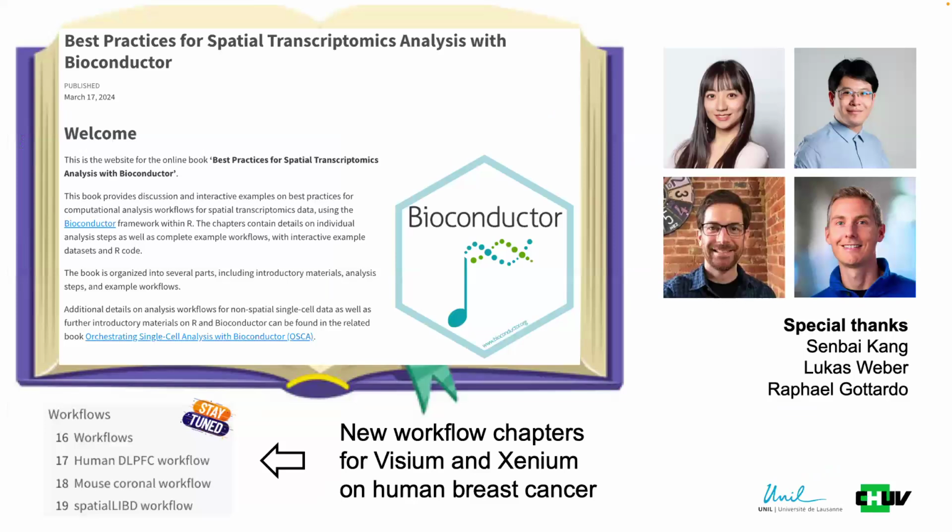The next step is that we're trying to integrate what we have here into this best practices book, and there will be 2 new chapters on cancer with Visium and Xenium. I hope everyone can contribute, because this is a book that we're trying to push out within the next 1 or 2 years. We're still missing quite some chapters on deconvolution, clustering, and also some spatially relevant techniques such as QC, or some philosophical chapters that everyone can contribute. So that's the end of my presentation.